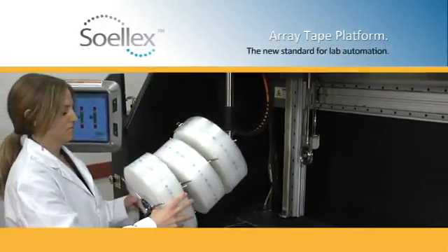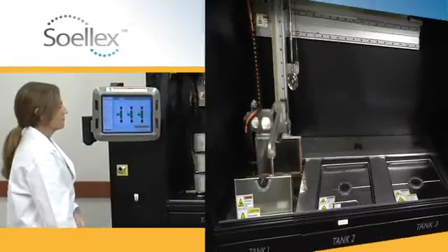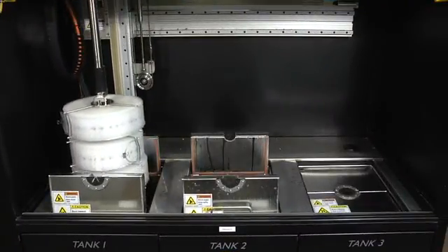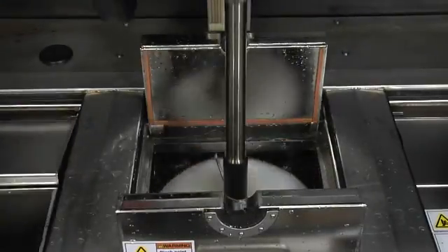The second step is to amplify the DNA in the Soellex PCR Thermal Cycler. As the samples move from chamber to chamber, or one temperature to the next, the DNA samples are amplified exponentially.